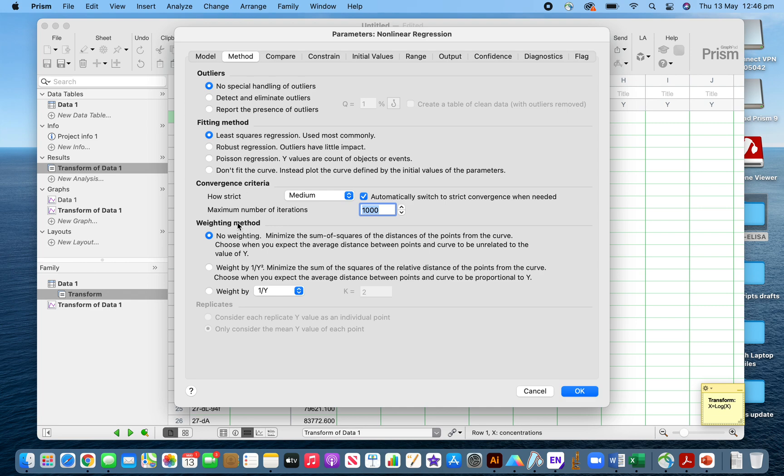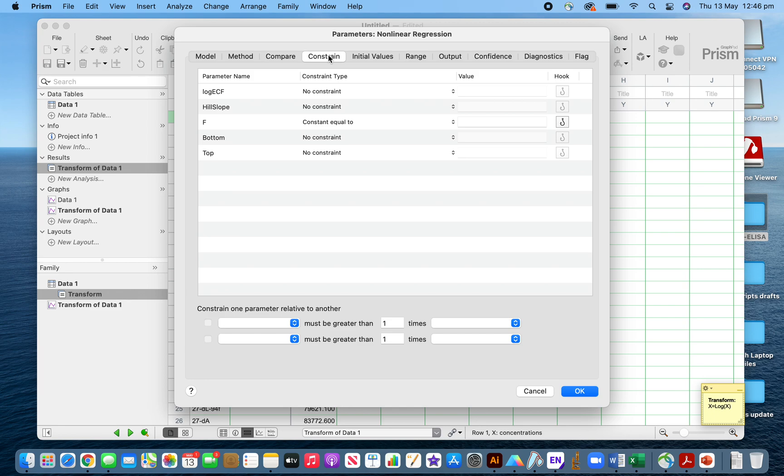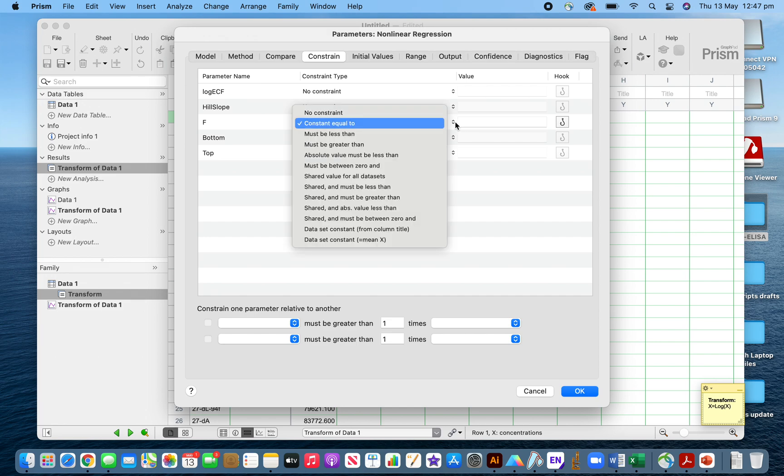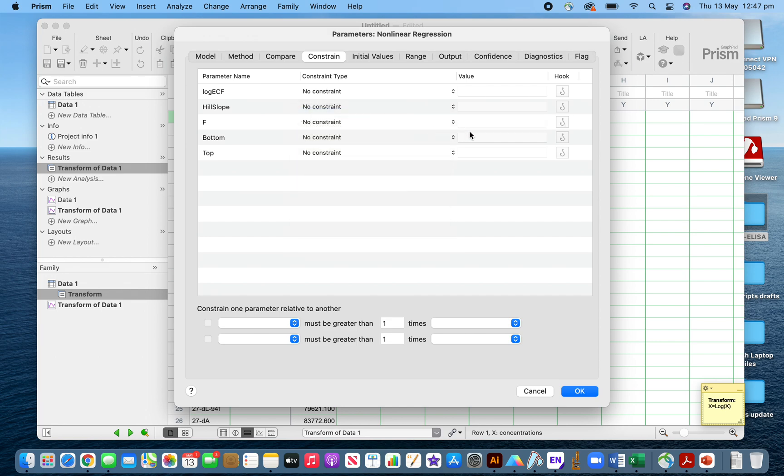As per the recommendation of the alpha ELISA manufacturer, I have to make the weighting one by y squared. The constraint could be a factor here. Sometimes you'll find no constraints, or sometimes the constraint is set.